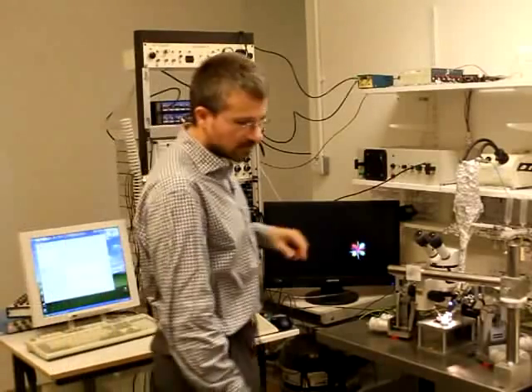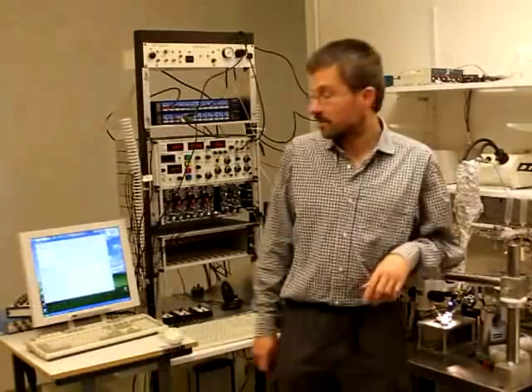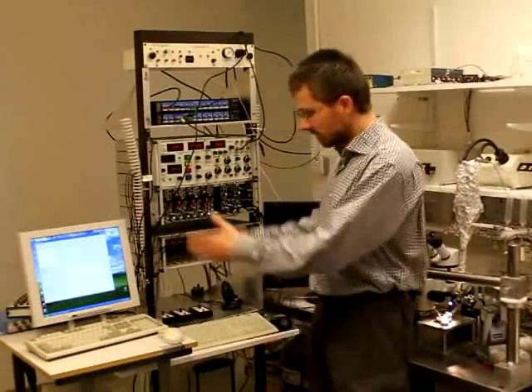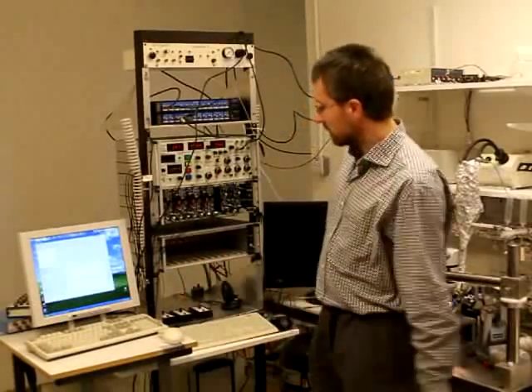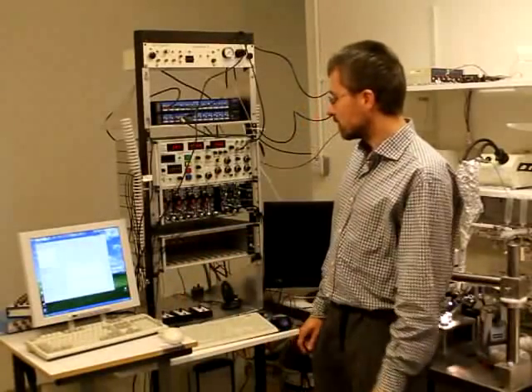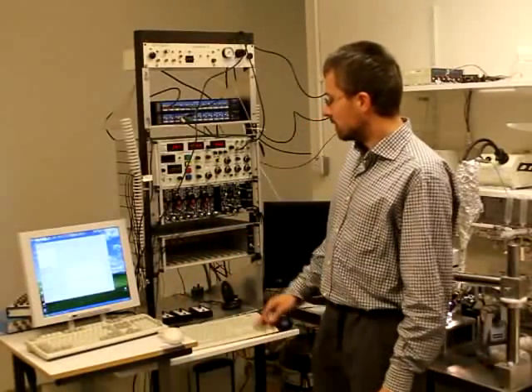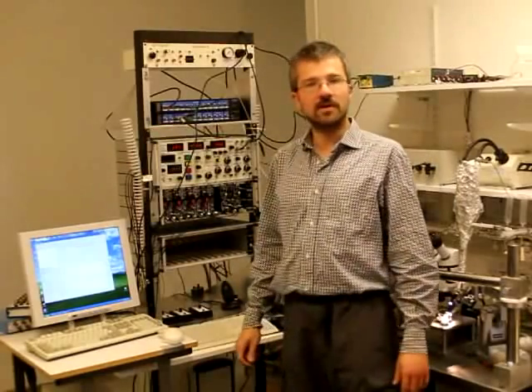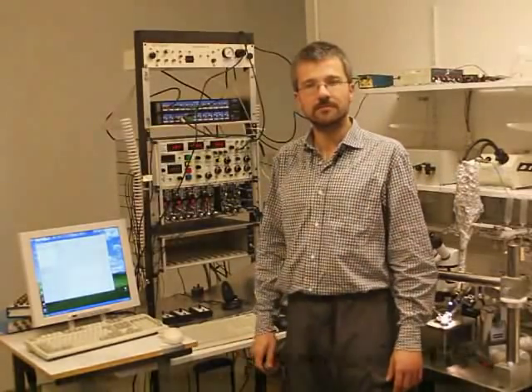What makes the dynamic clamp setup is this side, where we have an extra dynamic clamp computer with interfaces that are hidden in the back and we'll discuss more in a minute.